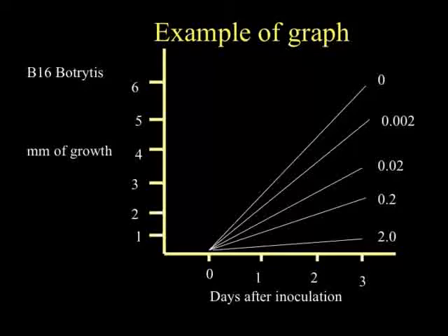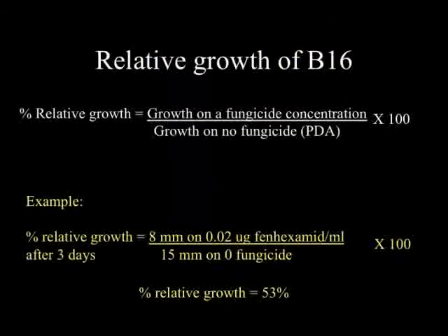And you can do that with the Excel spreadsheet. And if you're not sure how to do that, if you look in the written directions, again, those directions are in the Lab Report Resources folder. I explain exactly how you can take that data and use Excel to create the graph.